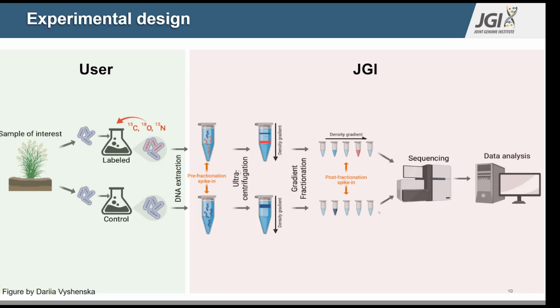because isotopically labeled DNA, if it has the carbon-13, will be slightly denser or slightly heavier, and it will work its way down the column further than isotopically light DNA. So you'll have the bottom portions of this tube have more carbon-13 DNA, and the top portions will have more carbon-12 DNA. And of course, it's not really a steady band like is depicted in here. It's kind of a gradient as such, but you get the idea.